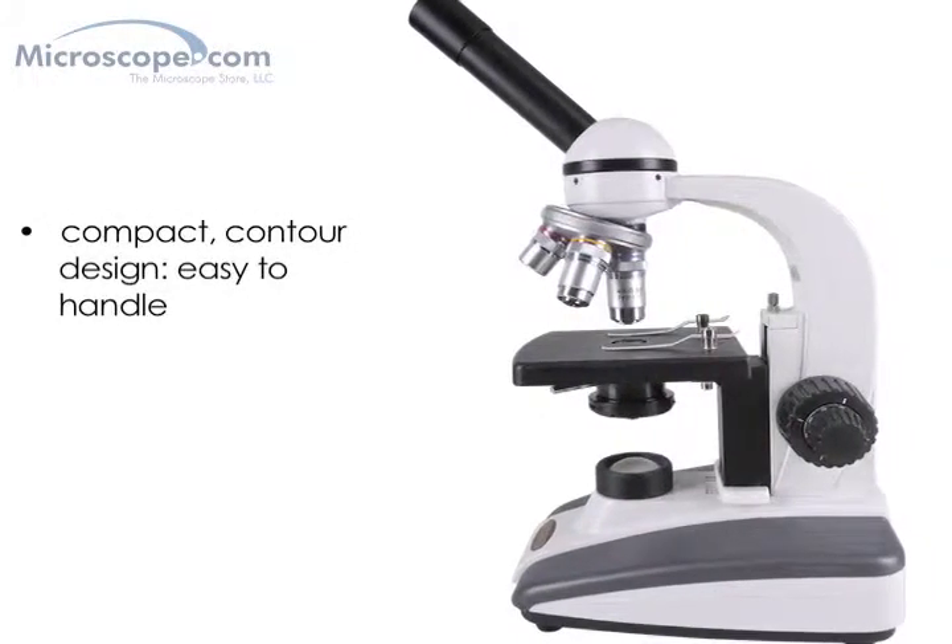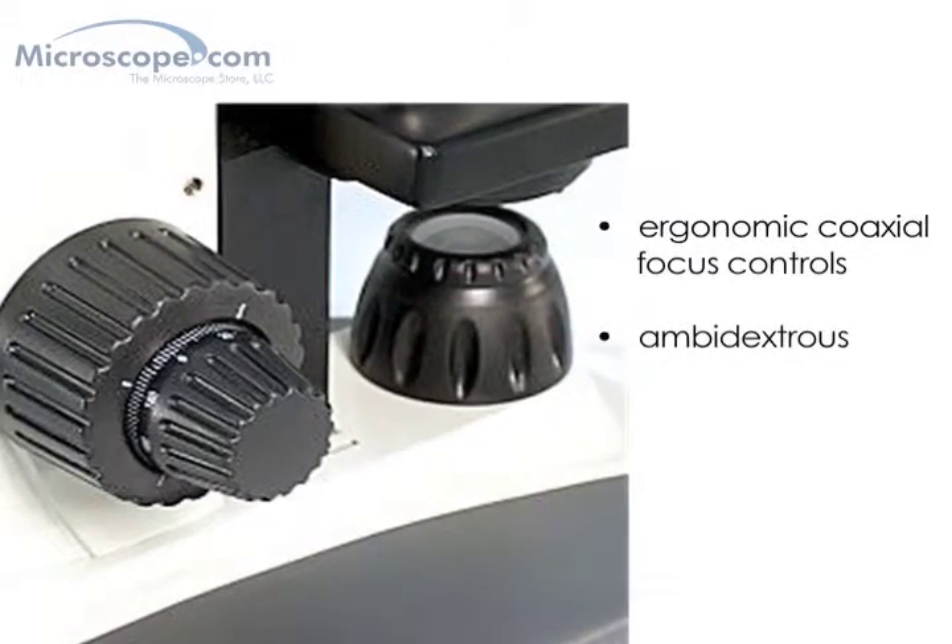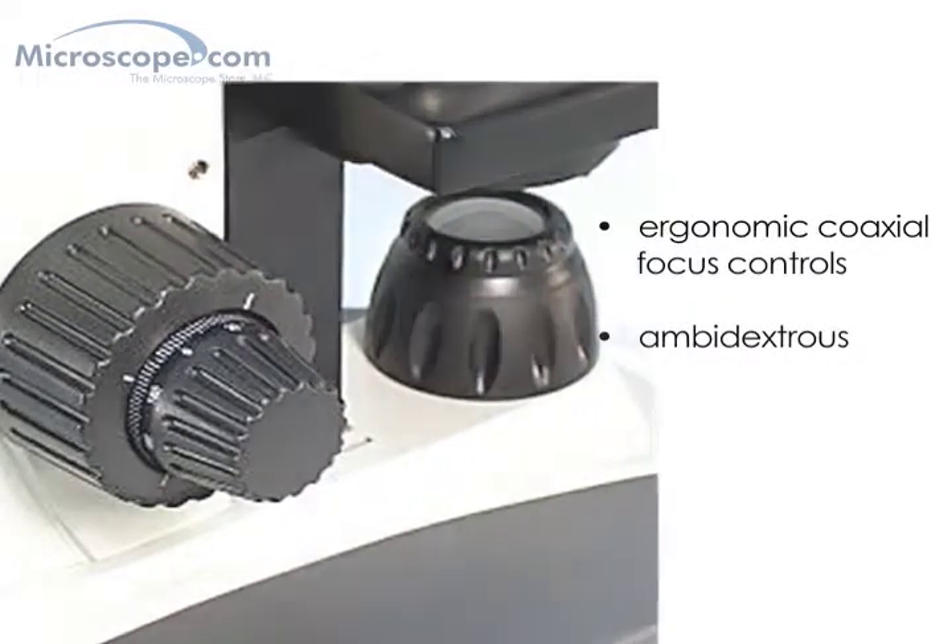which makes it easy to handle for both students and adults, and features ergonomic coaxial focus controls that are ambidextrous for right- or left-handed use.